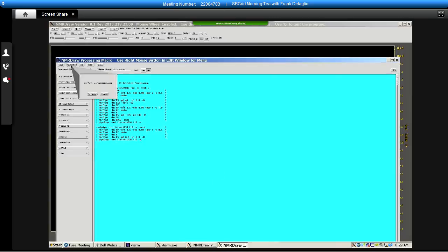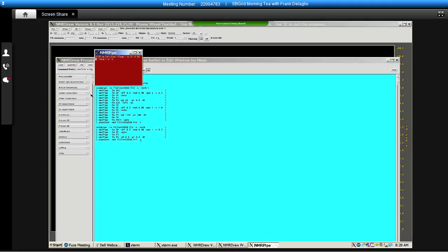So I'll use this scheme, and it's counting through all the planes as it processes the first two dimensions. And now it's processing the vectors in the remaining dimension.